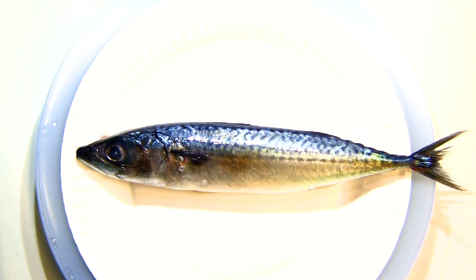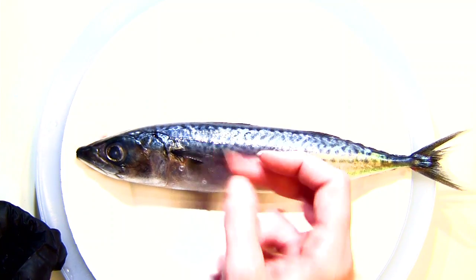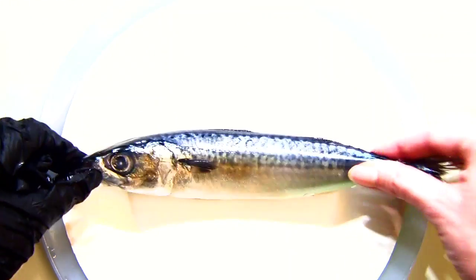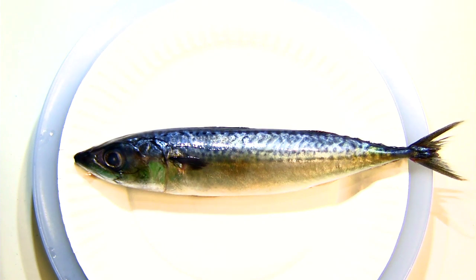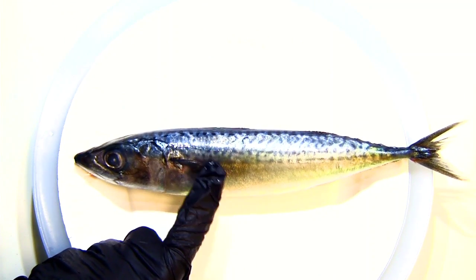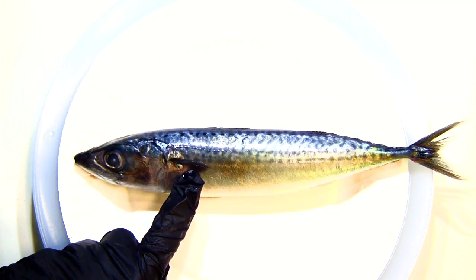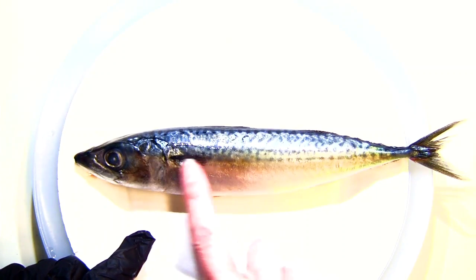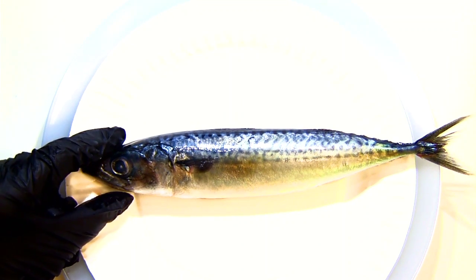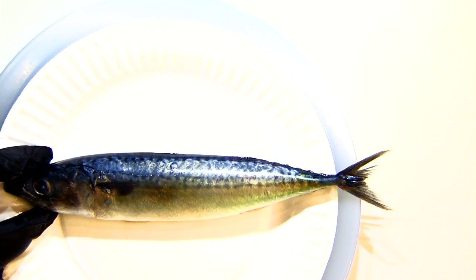These pectoral fins can be used in different ways on different types of fish. This one uses them mostly for steering, keeping them close to its side. Some fish use pectoral fins to move forward through the water and tend to have wider fins. Notice the fusiform body shape - long and skinny - which helps it move through the water fairly quickly. The very forked tail also indicates this is a pretty fast-swimming fish.